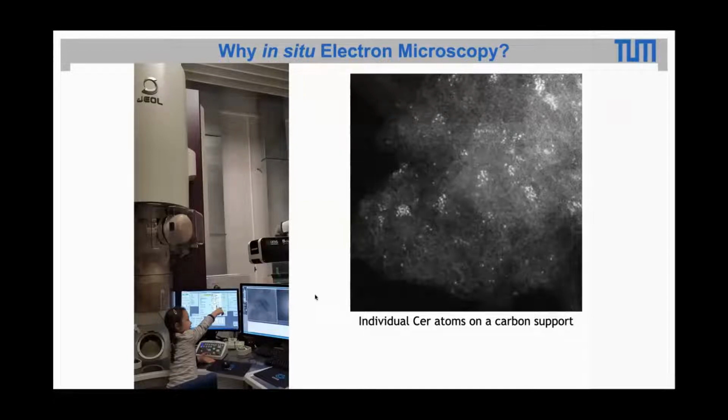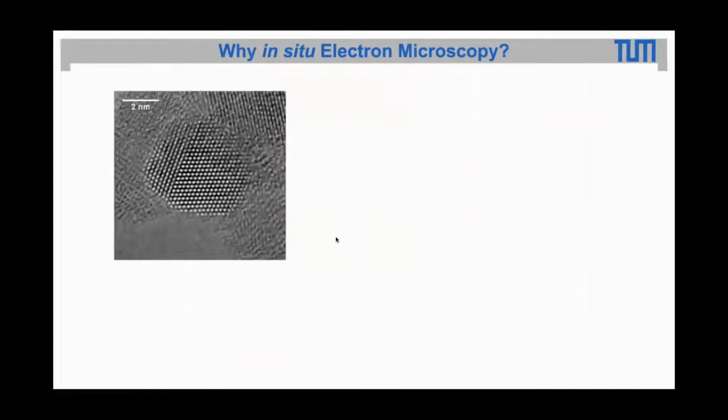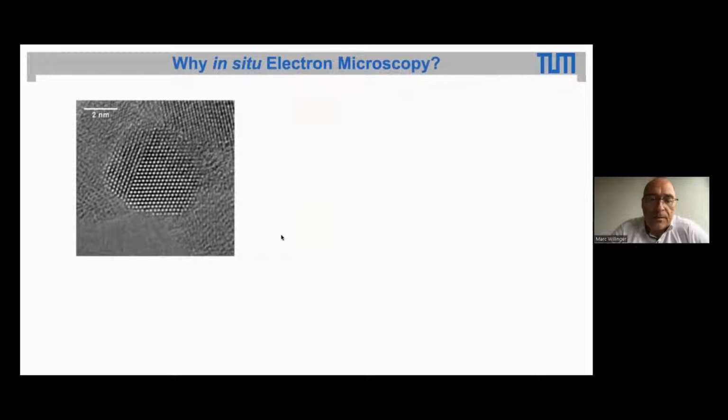Now this is what microscopes can do, and you can even record EDX spectra and identify the atomic species, and you can record energy loss spectra and get chemical information about oxidation states and all these kinds of things at very high resolution. Now here we have used these images generated by electron microscopy to characterize materials. And when materials are used for something, like when we study the properties of materials, like in catalysis, for example, that's the field where I'm working, we have these pictures with all details and resolution and everything.